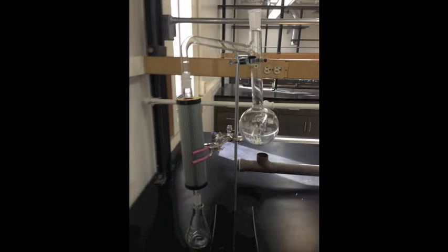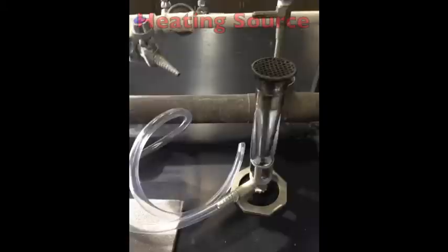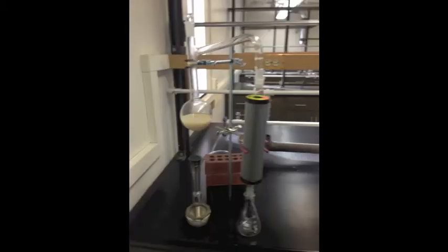Now add the ethanol solution that is to be distilled in the distillation flask. Once added, insert the glass cap that has been provided to reduce the loss of volatiles. Next, place the heating source, or Bunsen burner, under the distillation flask. The distillation chamber is now complete and should look similar to this.